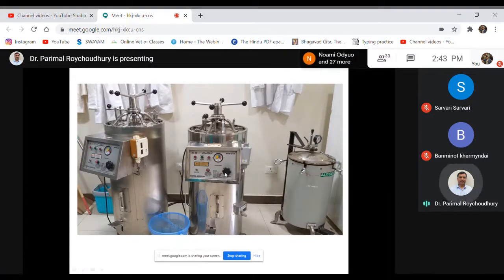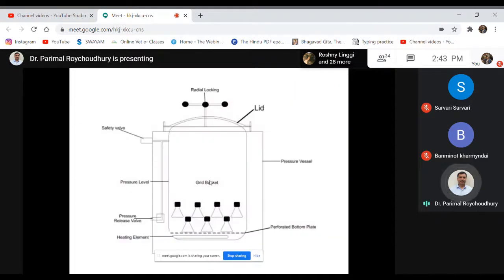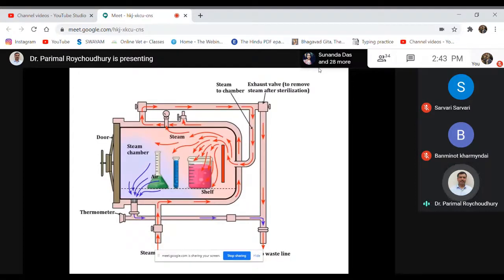There are certain adjustment knobs like this and this and this here, through which we can maintain this pressure at a constant level for 15 minutes. So after completion of the 15 minutes, we switch off the machine, and gradually we allow it to cool down. So thereby, within this 15 minutes at 121 degrees centigrade, we can sterilize the item. So this is called the autoclaving process. Some safety devices are also present here.